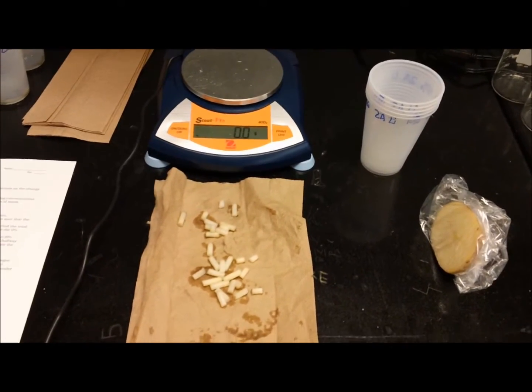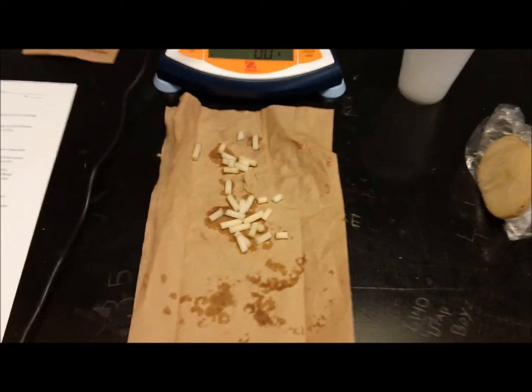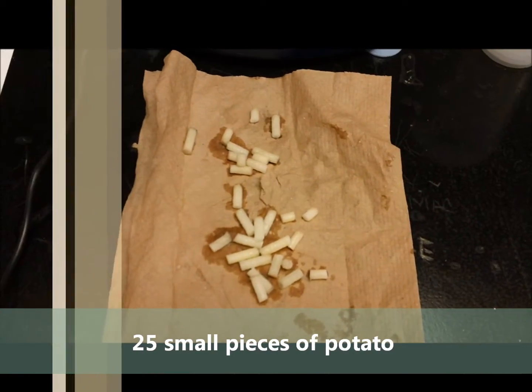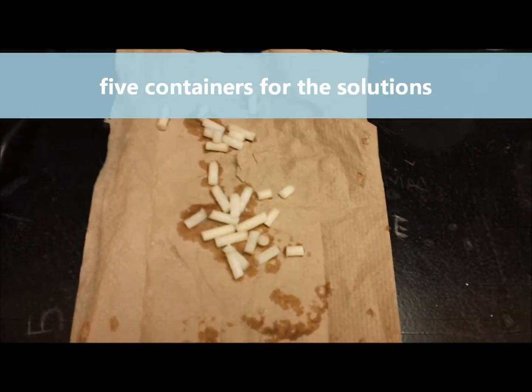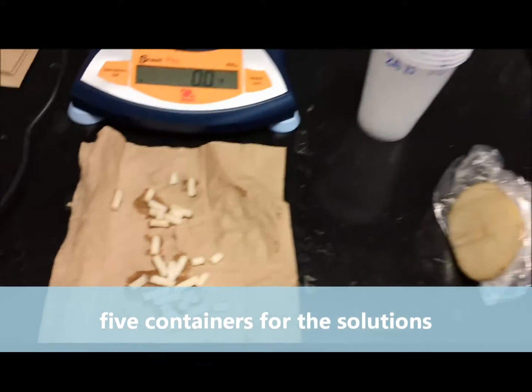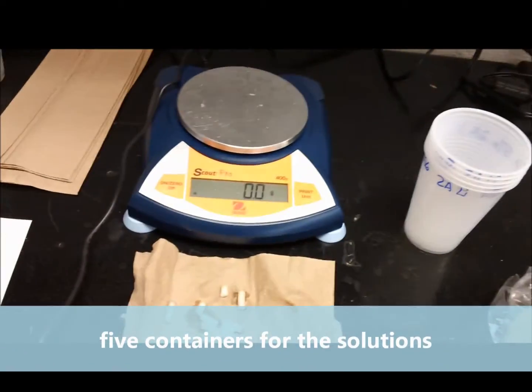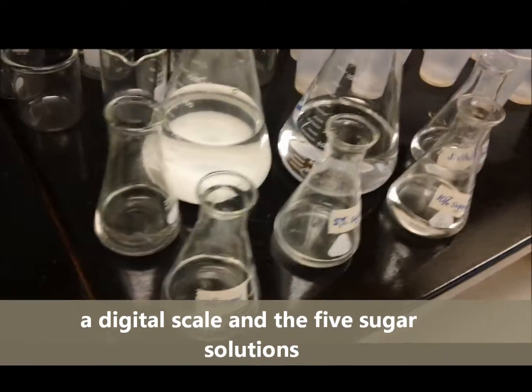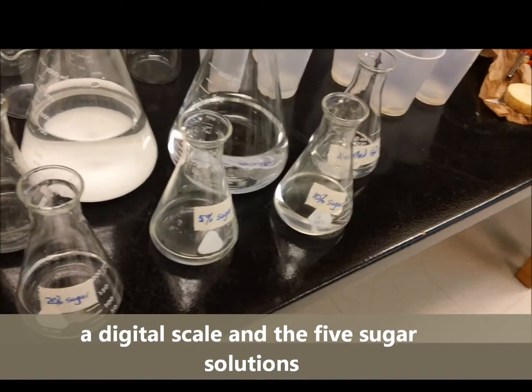To do the osmosis and potatoes lab, you will need 25 small pieces of potato. These were cut out using a cork borer, but you can just dice them into small squares. You'll also need a container, a digital scale, and your five different sucrose solutions.